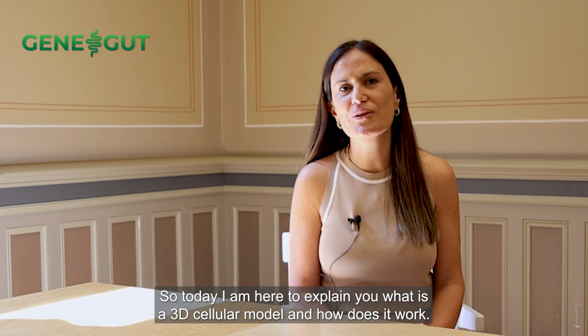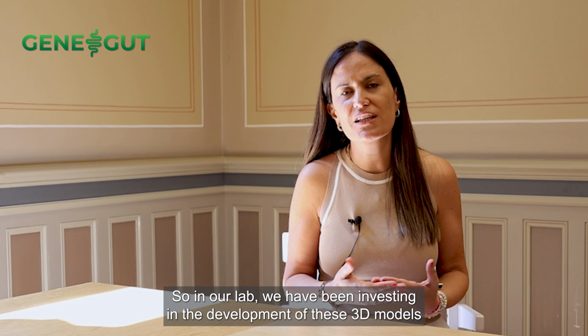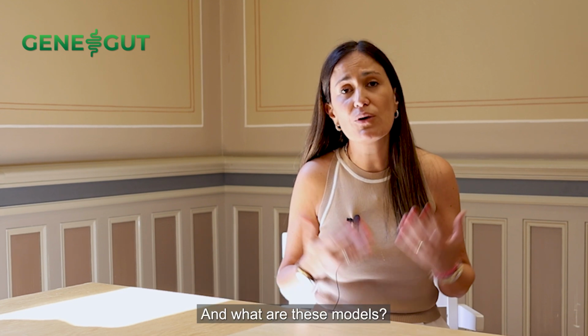So today I'm here to explain to you what a 3D cellular model is and how it works. In our lab, we have been investing in the development of these 3D models to study Crohn's disease and to address the potential of using this model to screen novel therapies. And what are these models?